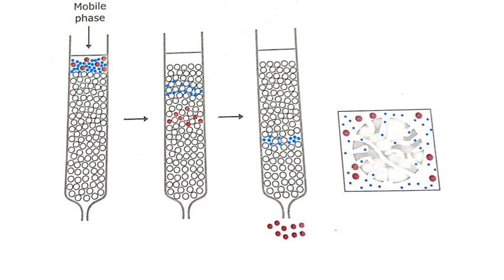Here you can see the whole process. If you know a little bit about chromatography, then you are introduced to its picture. Here is the chromatography column, and inside the column there are beads, and we can see two types of molecule, one large and one small. Large is the brown molecule and blue is the smaller molecule.